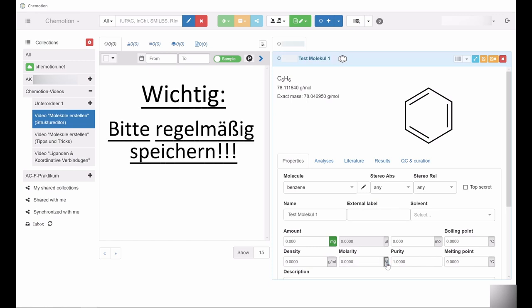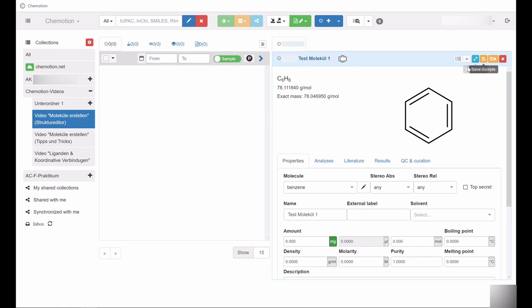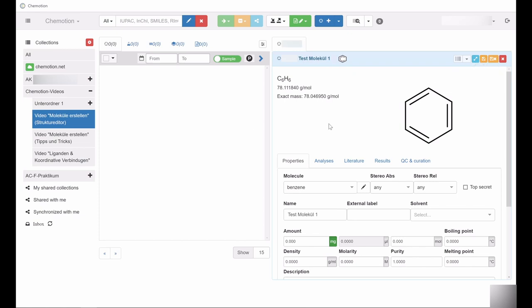Please note that you should save your progress regularly. When information is changed or added, the upper bar of the sample window features a light blue color. After saving, the color changes from light blue to dark blue.